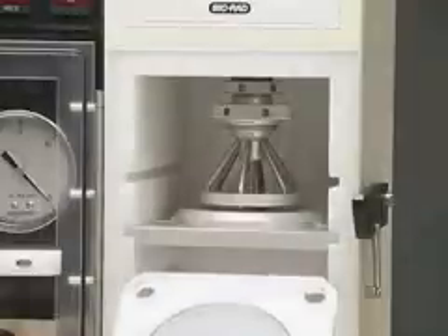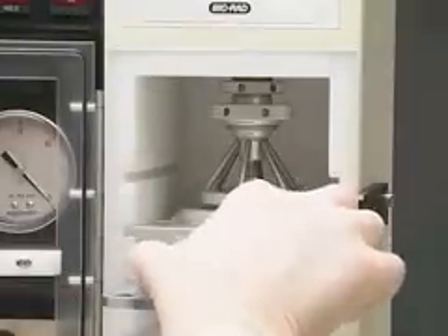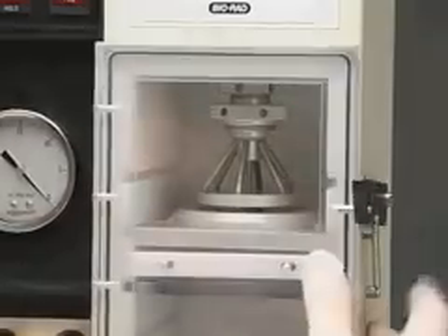Tighten the lower ring. Place the sample on the target shelf. Close and latch the door.